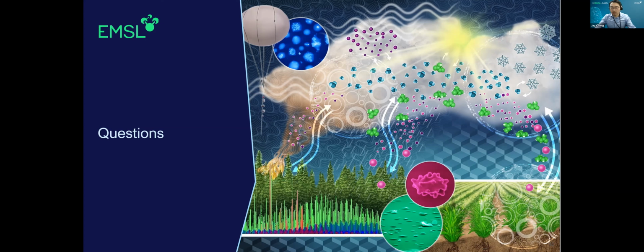Thank you for the question. The short answer is yes. So as Greg mentioned, we can connect either online aerosol mass spectrometers or collect filters for offline mass spectral analysis. Since our combustion system is like a combustion aerosol generator, it can be used for both online and offline analysis.